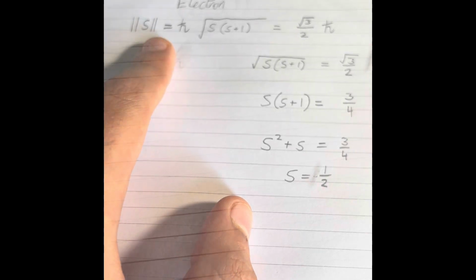and you get the spin of the electron. So the total spin of the nucleus depends on the spin of any nucleons, and all the nucleons will have the same spin value as an electron, which is a half. But where it gets difficult is when they start to pair, the S values begin to cancel out. So your I value can either be a half or it can be an integer.